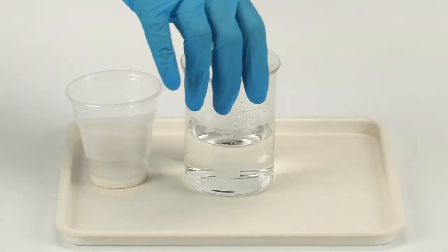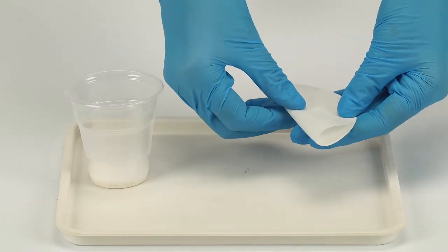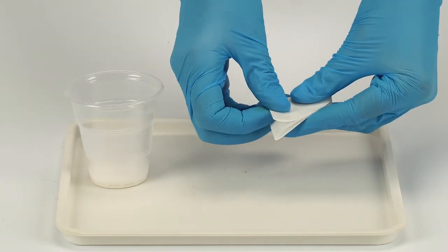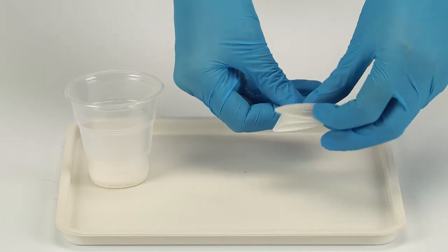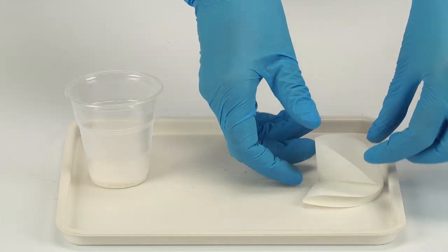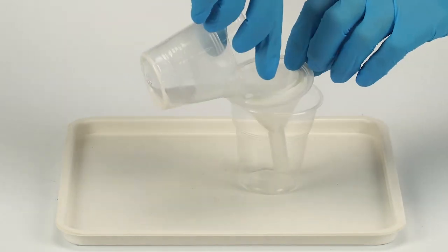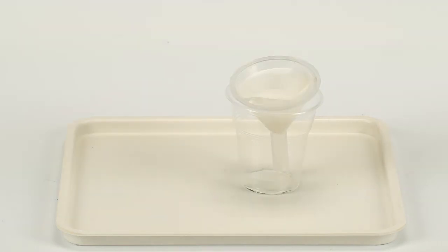Now, filter the solution off. Fold a piece of filter paper to make a filter cone. Assemble the filter. Put the plastic funnel inside a clean plastic cup and the filter paper inside the funnel.